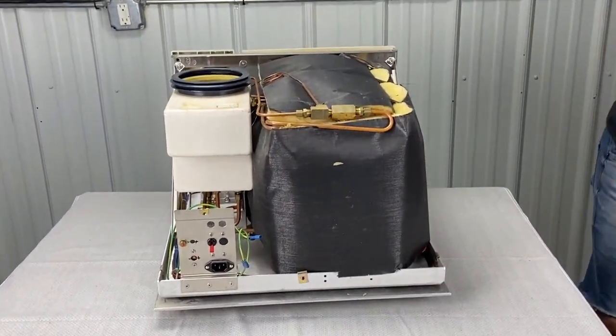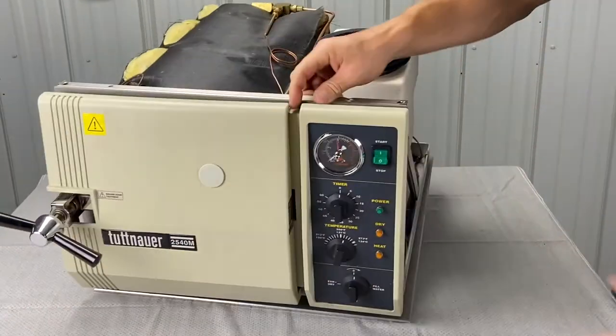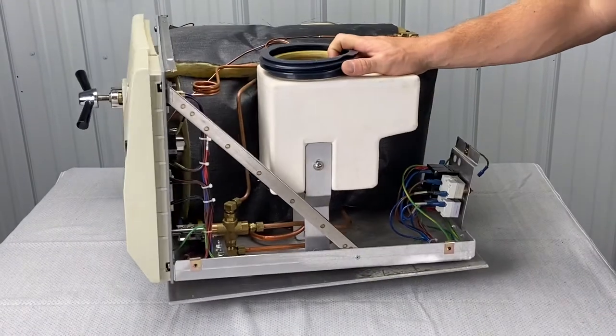And then just take the top off — slide right off. Now we reveal the Tuttnauer autoclave. This is a manual model. Nice and clean.